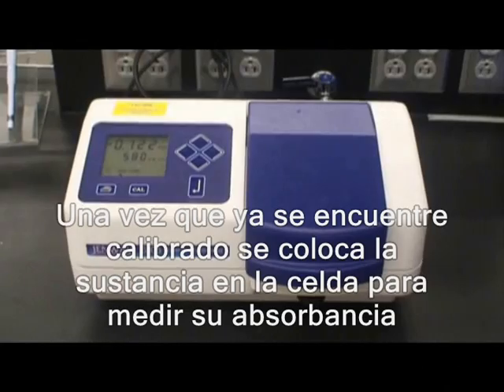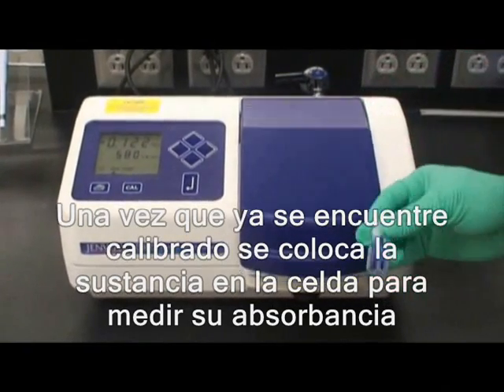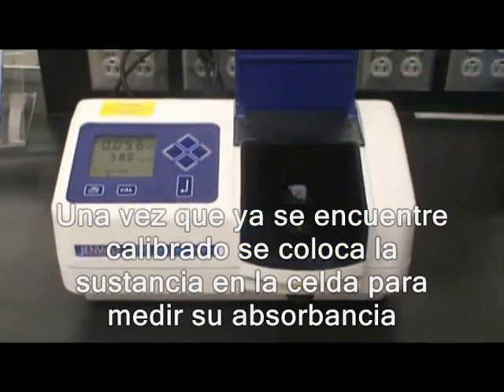Once properly calibrated, samples may be placed into the spectrophotometer and the absorbance recorded.